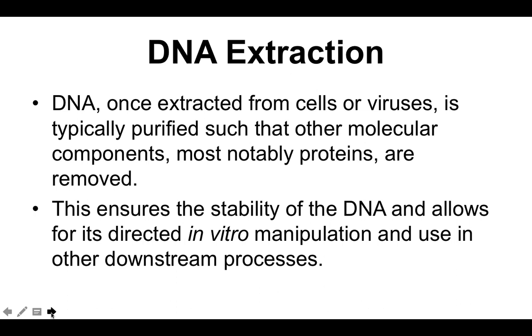Because when you open the plant cell, you of course expect other components aside from DNA: you will expect another type of nucleic acid, the RNAs, and also big molecules like proteins and carbohydrates as well as lipids.